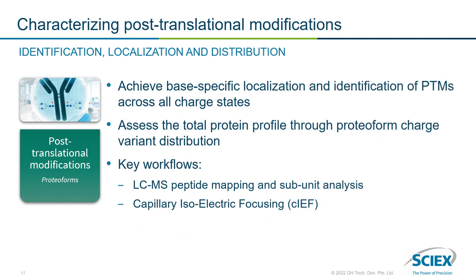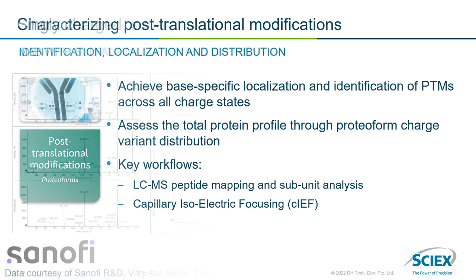Now we can all take a quick breath and move right on to post-translational modifications. And this is where things are going to get really jazzy because we're not just talking about mass spec anymore. We'll start though by using LC-MS to revisit the popular peptide mapping and subunit analysis workflows. And then I'll hand it off to my colleague and we'll use capillary isoelectric focusing and charge variant distribution.